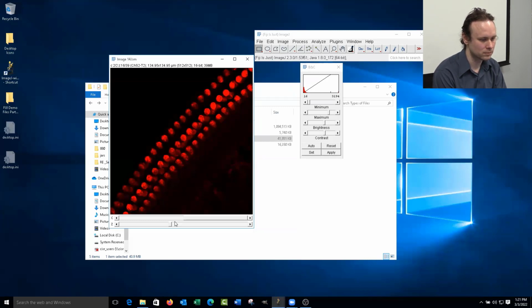All right, one more question from Megan. Does pressing auto change the min max for every channel or just the one you're currently viewing? Oh, it only changes the current one you're looking at. So that's very important. You'll need to go through each channel and do them individually. The reason is that each channel is kind of independent from one another. They're not acquired with the same settings, so it's really inappropriate to make some global adjustment. Each channel will need its own.